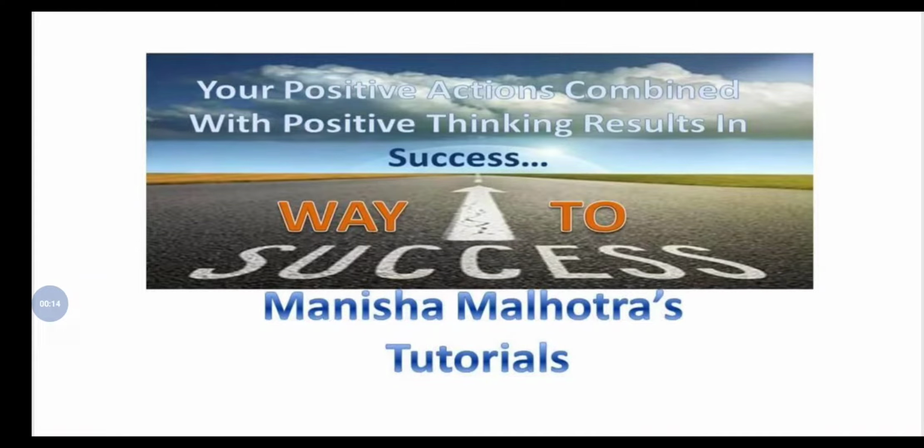So in our last lesson we started the discussion about different methods of DNA extraction and purification. The first method we discussed was the phenol chloroform DNA extraction method, which is a kind of organic DNA extraction method. We read about the principle and the mechanism of that particular method, and there I left two things.